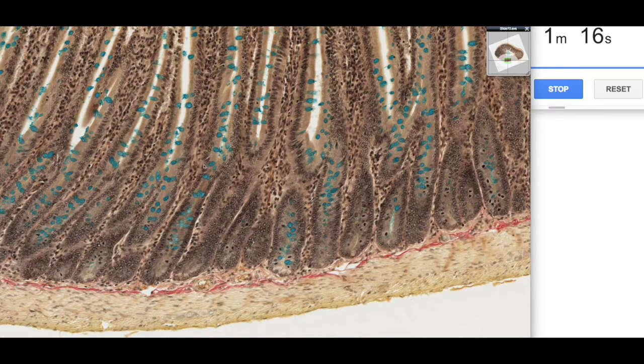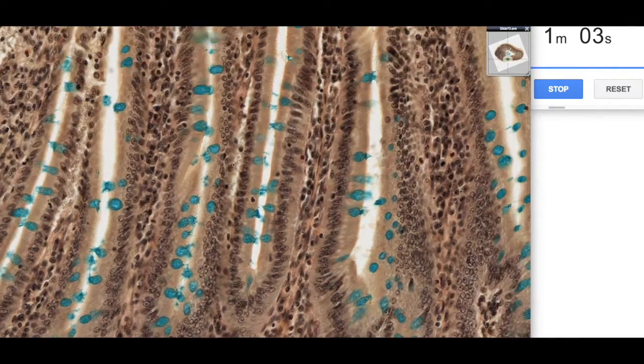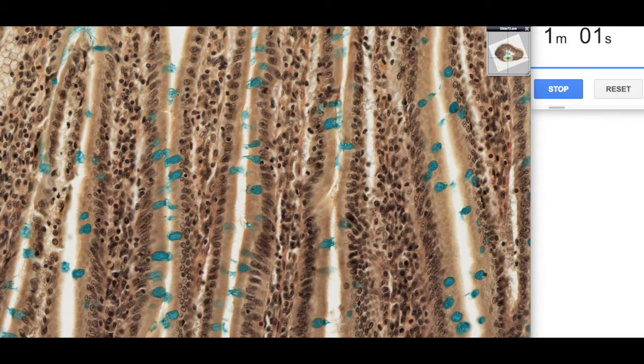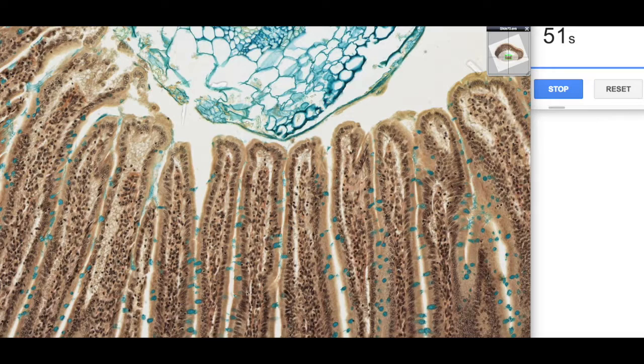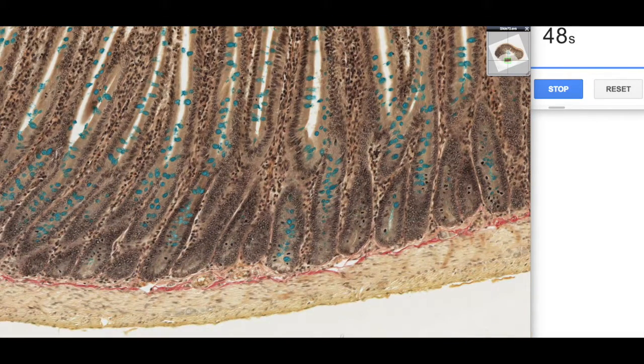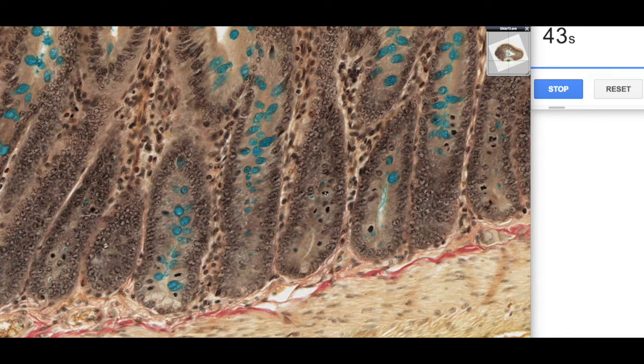So you can see these intestinal glands extending down into the base of the intestinal crypts, or the crypts of Lieberkühn, and you can see that the goblet cells originate from the base of these glands, and then eventually they migrate their way back onto the surface of the villus, the small intestine epithelium there, and then eventually they're lost from the surface there, and they get replaced continually through mitosis from those intestinal glands. So you can see them scattered throughout there. These little dark bodies represent mitosis. So we've got lots of mitosis happening at the base of these crypts of Lieberkühn.